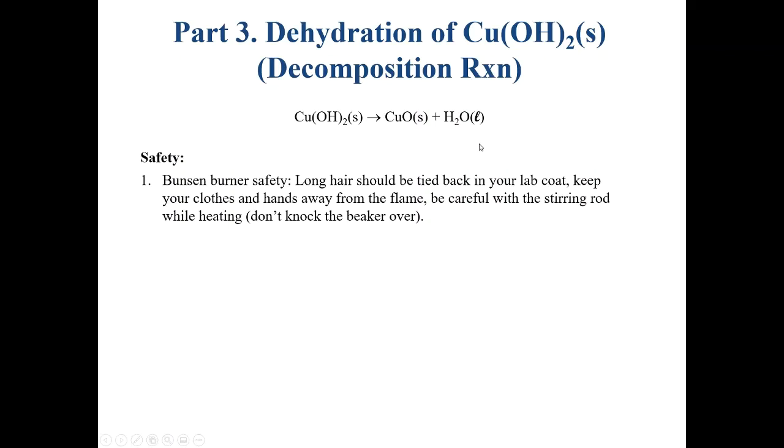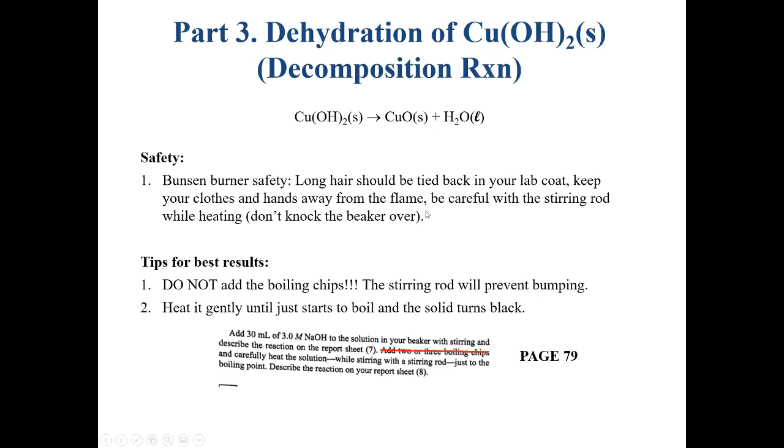solid also. And you'll notice that one of the products of this is H2O. So the H2O comes off as both a liquid and a gas. So you'll notice some water coming off. So we would accept on a quiz either H2O liquid or H2O gas, because essentially the water that's coming out is going into the water that's surrounding the solid, but also some of it's being evaporated as the reaction goes on. So again, you'll notice that they're using a Bunsen burner, and if you guys were doing the lab yourselves, we would be telling you, keep your hair tied back, keep your clothes and hands away from the flame, and so on and so forth.